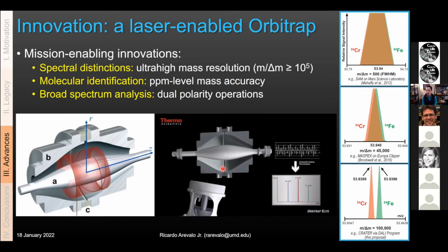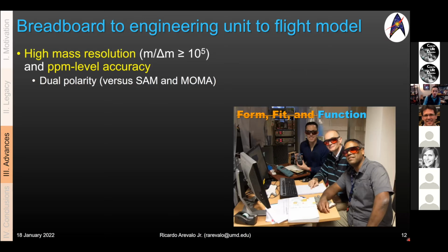It's a little bit different than other types of mass spectrometers that actually collect the ions that you're trying to analyze. Here you're oscillating the ions around a football-shaped electrode, kind of like it's playoff time. I'm thinking very football. It's a very stretched out football, but the ions oscillate around that electrode, and the speed at which they oscillate is correlated with their mass to charge ratio. So you actually just watch them go back and forth, and then you use fast Fourier transform to give you the frequency and thus the identity of that mass to charge ratio. So it works a little bit differently.